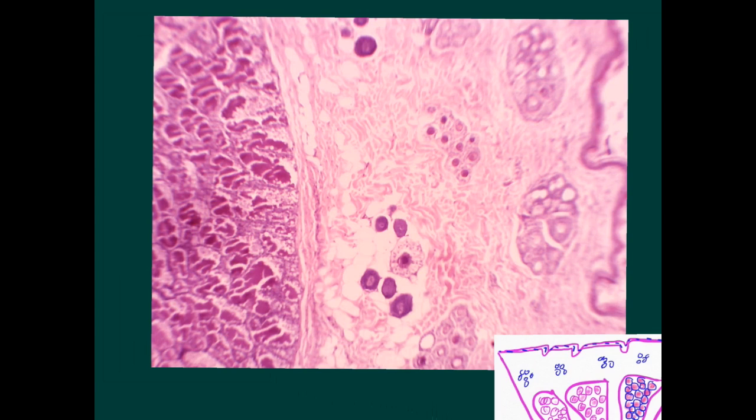Now we have here the skin, keratinous stratified squamous epithelium, and here we have hair follicles. Here we have glands present in the dermis of this skin with many fat cells. All of this is the skin covering, and then we will see a lobule of the breast, and the acini are filled with this red or pink secretion, which is the milk secretion.